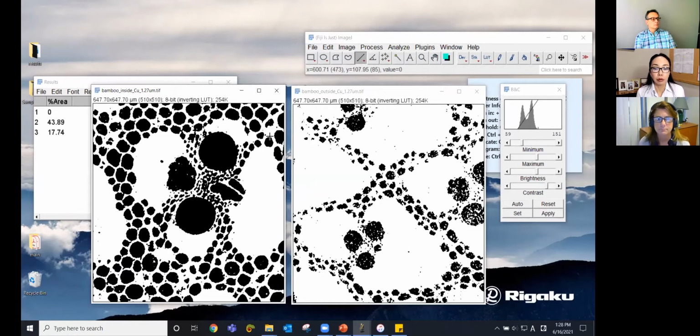Now, before we move on to the 3D version of this scan, actually, there was one more question that we wanted to ask the audience. So Angela, let's ask them the second question. Okay, so question number 2 is, does the file have the voxel size information? So we'd like you to select yes, no, or we can't tell without checking Analyze, Set Scale. So everybody weigh in on their votes for this, and then we'll share the results.